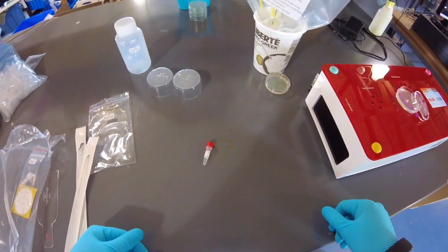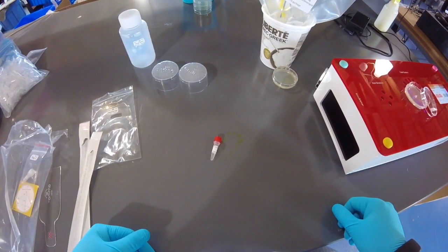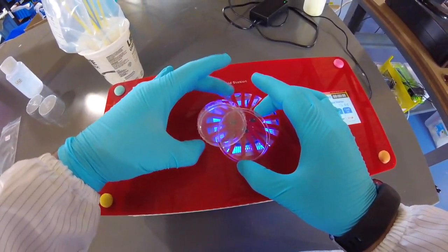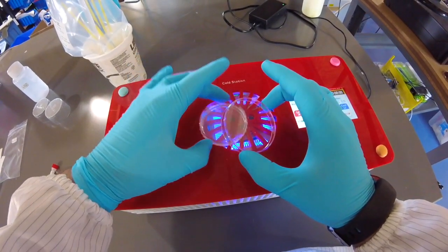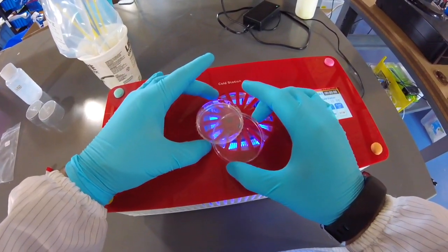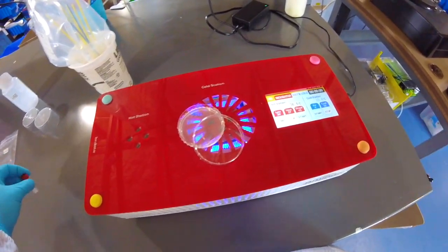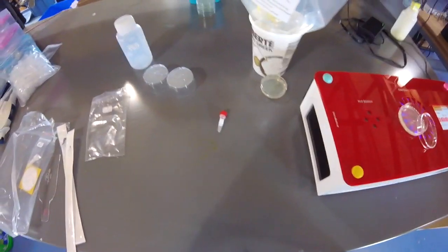And then they're not going to be on the agar, and your experiment won't be so successful. All right, so I'm just going to turn off the camera now, and I'll be back maybe in 10 or so minutes once this dish is dried. While you're waiting, you can turn it a little bit every once in a while. Just give it a little shift over. Again, you do not want to spill any liquid inside of the machine, or you are not going to be happy, or your teacher is not going to be happy. Okay, so I'll be right back.